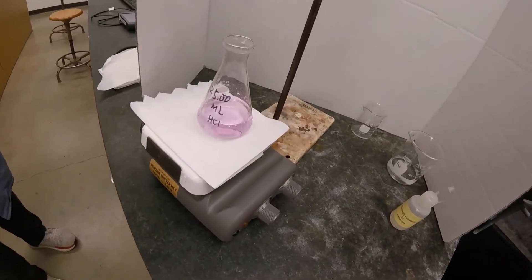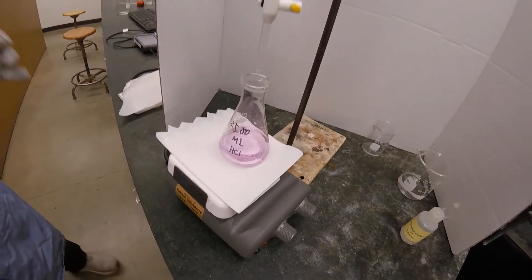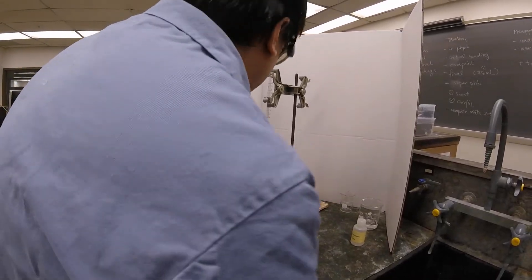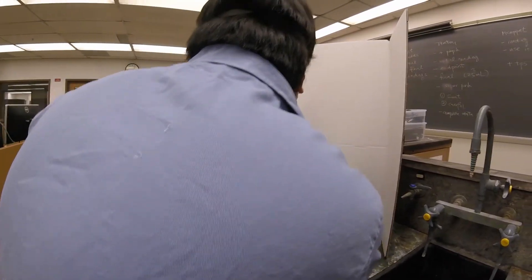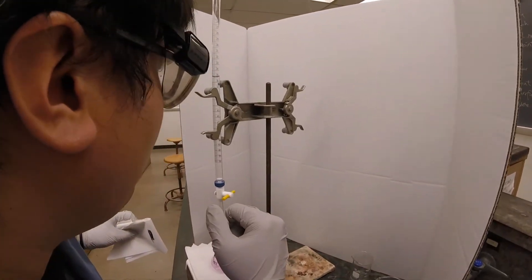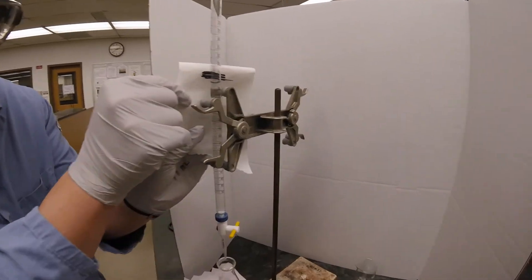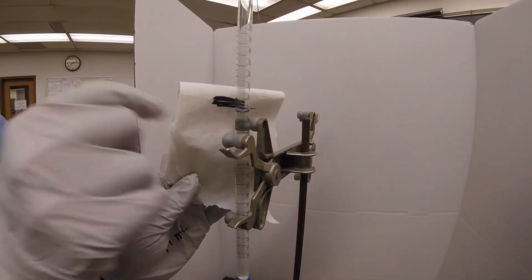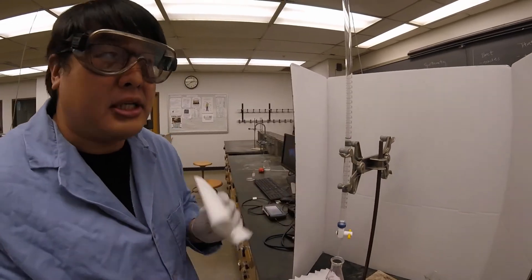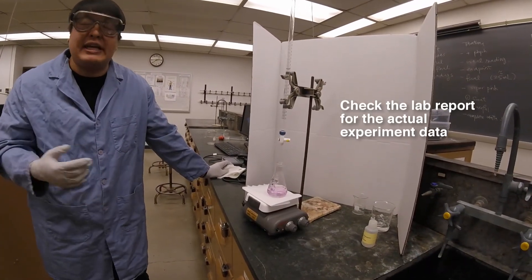As you can see, the solution has turned a pretty dark pink, so we've definitely overshot it — but that's okay, this is our scout titration. If I were to read this right now, this is about 35.18, so it's around 35 milliliters. So 35 minus eight, that was around 27 mils, basically.